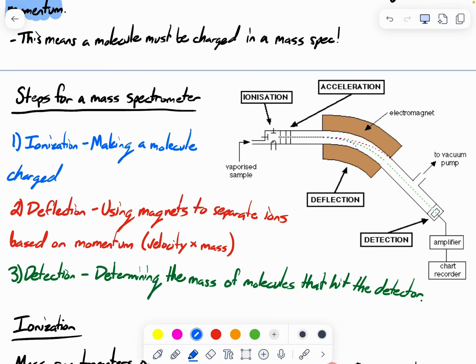Well, here we have a diagram of what a mass spectrometer actually is doing. And there's really 3 stages to this instrument. And again, as I had said back in OChem 1, but you're going to hear it again in OChem 2, you do not need to be super familiar with exactly the inner workings of all of these instrumentation pieces.